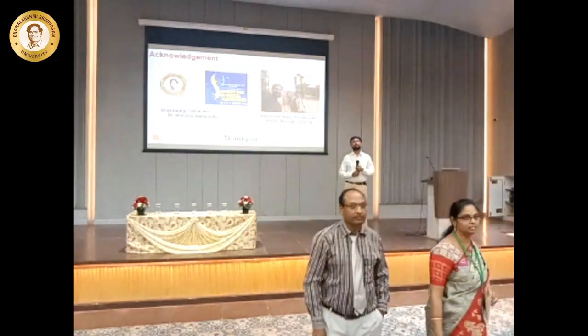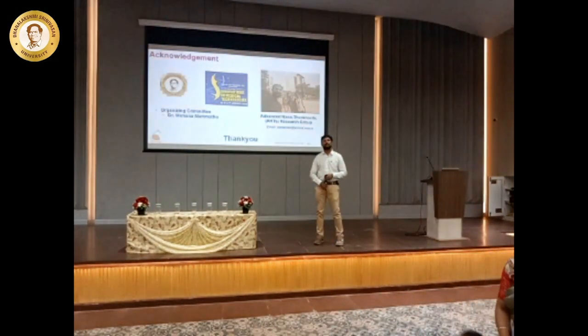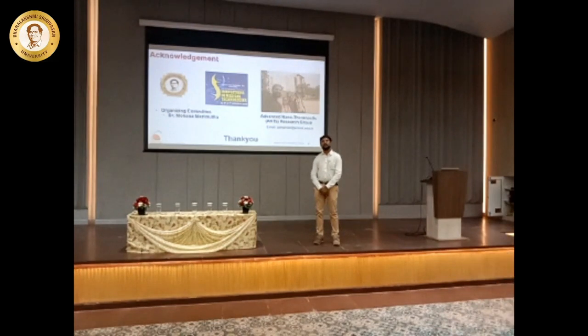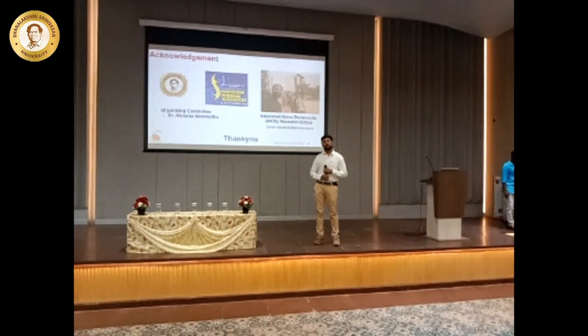Yes, please go ahead, Rizwan. Hi sir, this presentation is going to be very useful for interdisciplinary research areas, and thanks for that. My question is about sensitivity and surface area, which are very important for nanoparticles. Compared to other forms of nanoparticle synthesis, is there any difference for sensitivity and surface in this microfluidic synthesis?